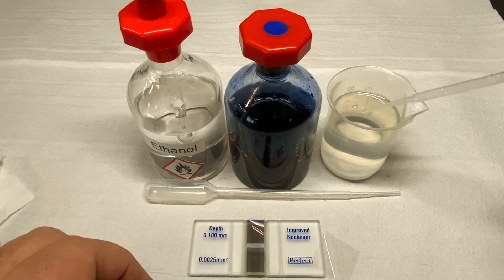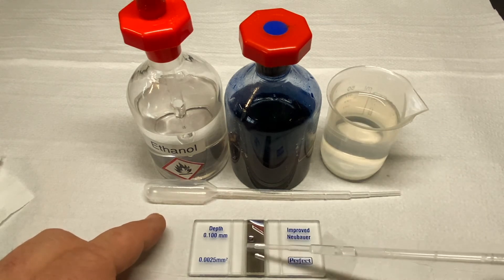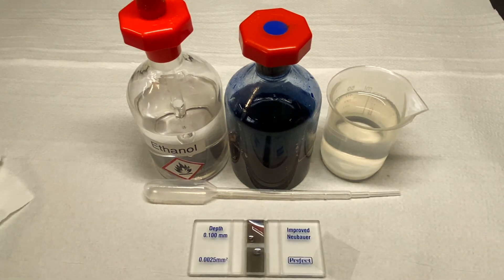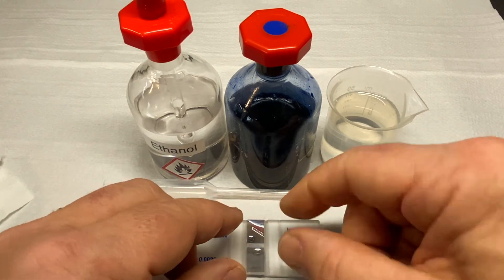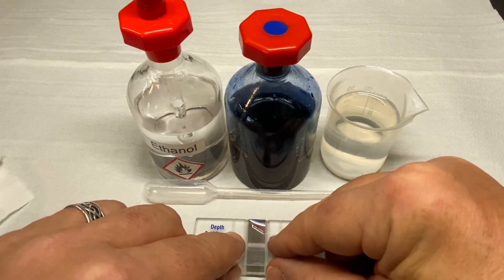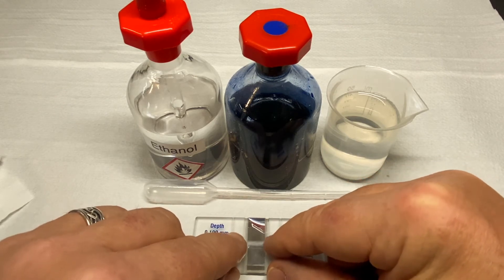Deposit a drop of water on each of the gridded silver sections of the hemocytometer. Carefully pick up the coverslip and slide it into position, exerting minimum downward pressure on the coverslip itself. Underneath the coverslip, the water will spread out into a film. Ensure the film of water reaches the edge of the coverslip.